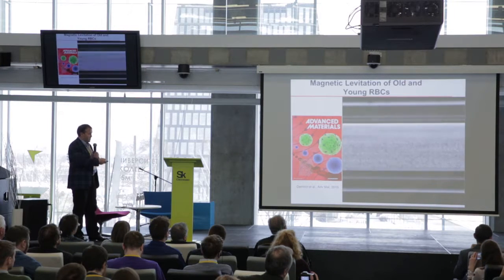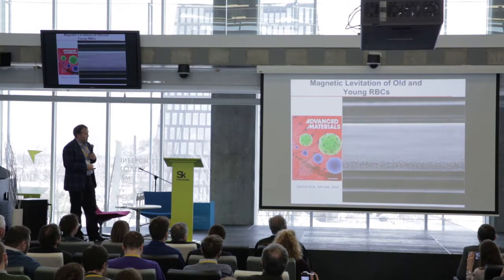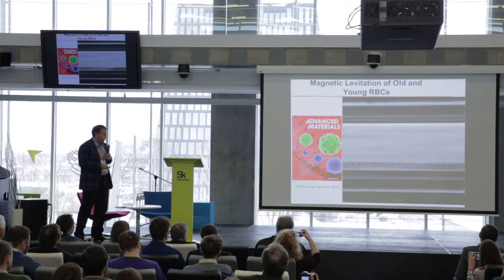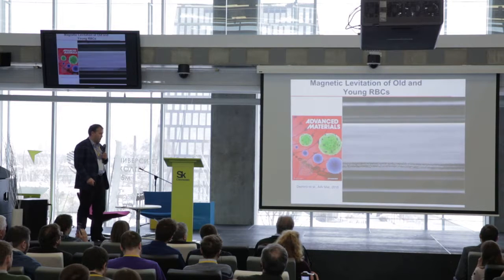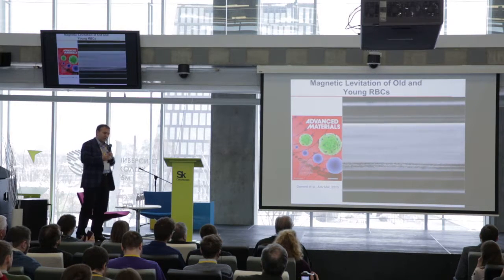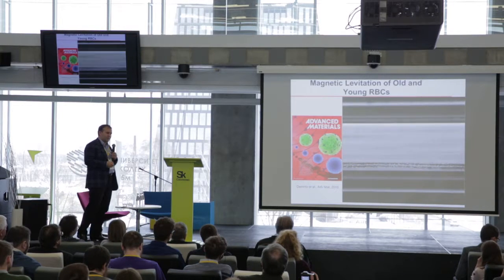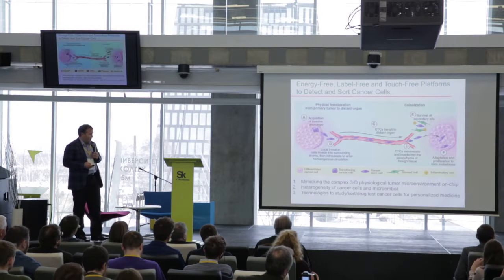And these are red cells in this 1 millimeter capillary that are being assembled, so they are going to the band where they deserve to be, and this is just because there is a magnetic force upwards and gravity downwards. There is, of course, some Archimedes buoyancy force, but the bottom line is here you are looking at red cells with different densities. We took blood from the same patient and processed it through a centrifuge to separate it into old and young cells, which are different in density, and we can see that profile also here at a single cell level. Why is this important?